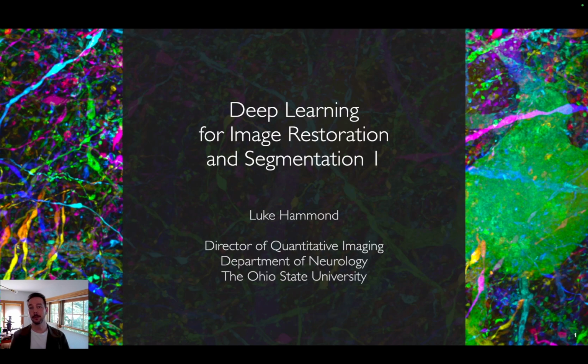I've worked with many people over the last few decades on image analysis, both through my time leading the imaging platform at the Queensland Brain Institute in Australia, and at the cellular imaging platform at Columbia University. I think these advances in deep learning can be applied to many problems that were completely intractable or very challenging just a few years ago. And I'm hoping that by sharing these tools for image restoration and segmentation, it'll allow you to approach projects that were impossible for you to approach or accelerate the research that you're already doing.